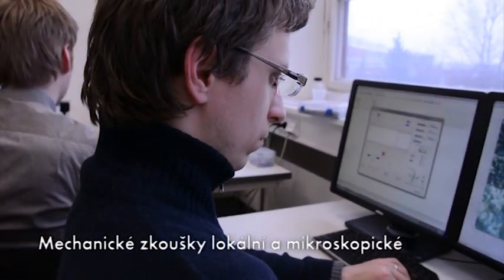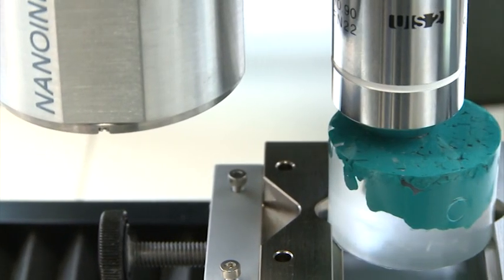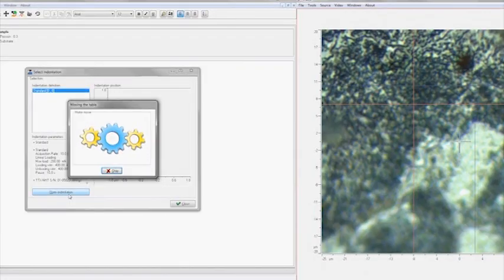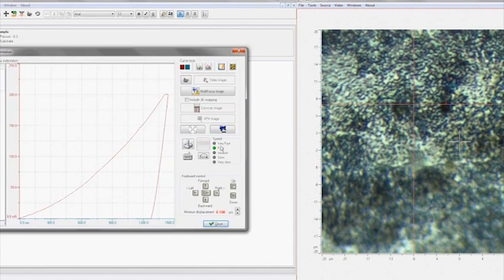Laboratoře lokálních mechanických vlastností umožňují měřit tvrdost materiálu škálou makroskopických metod, mikrotvrdostí i nanoindentací, která také umožňuje měřit modul pružnosti materiálu.